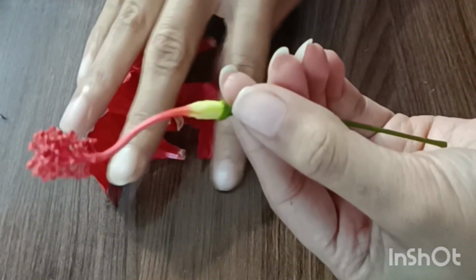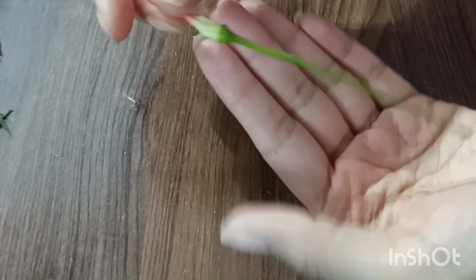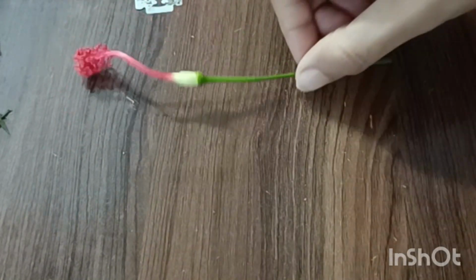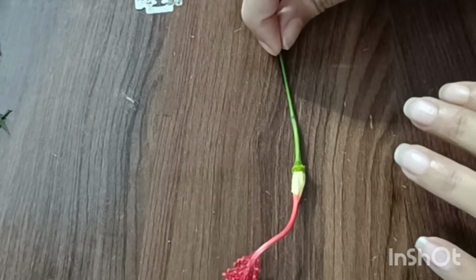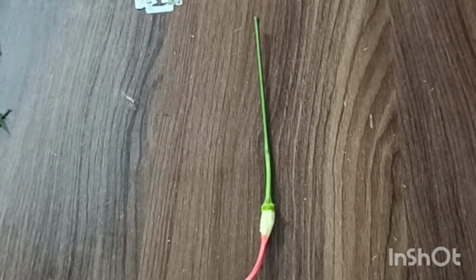Next, I observe the androecium. It consists of numerous stamens. Filaments are fused to form a staminal tube. Anthers are monothecous. This condition is called monadelphous.